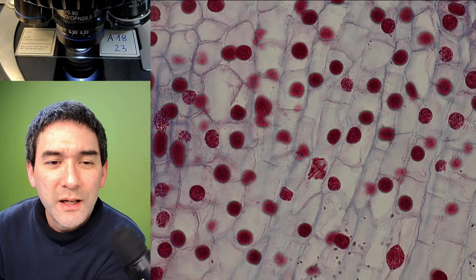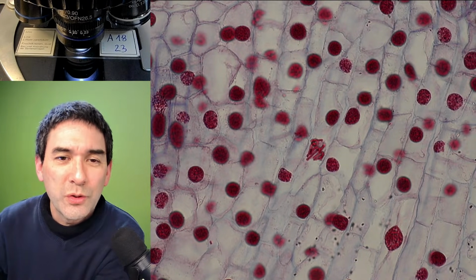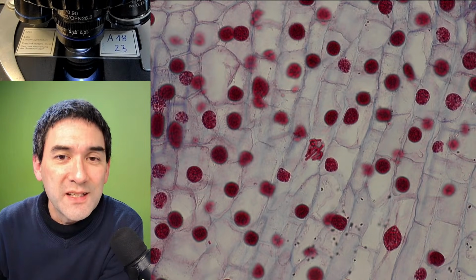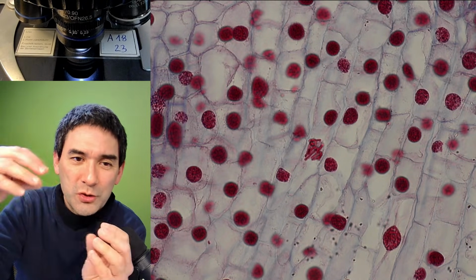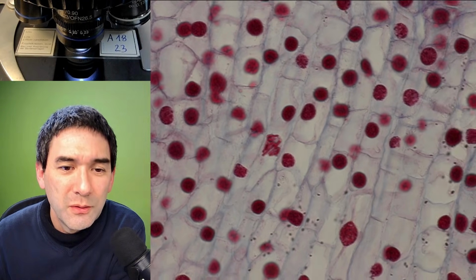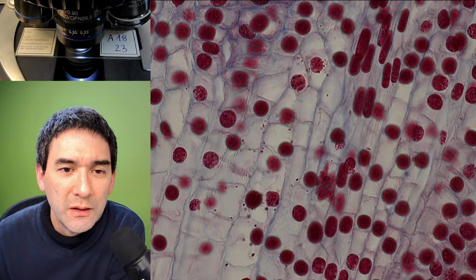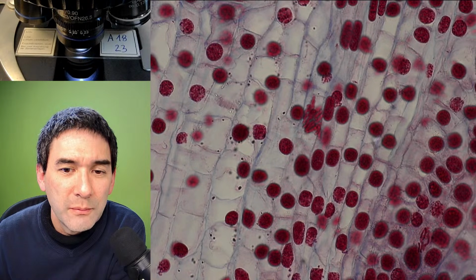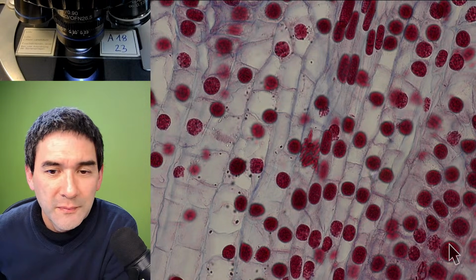What do you see over here? Right in the center, right in the middle. It's weird long structures. These are, of course, chromosomes. This is a dividing cell right in the middle right now. Those long structures are chromosomes. There are a few of those in the center as well. Here I'm going to show you again. These are also chromosomes over here.